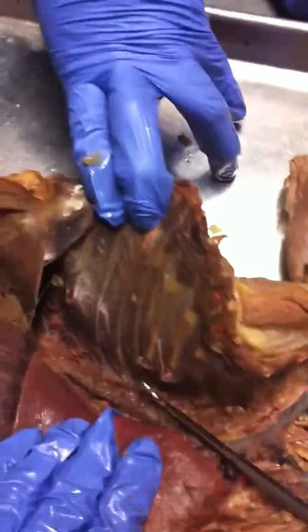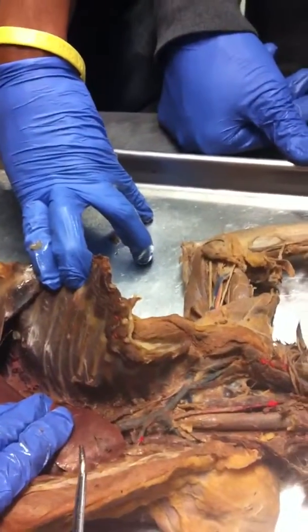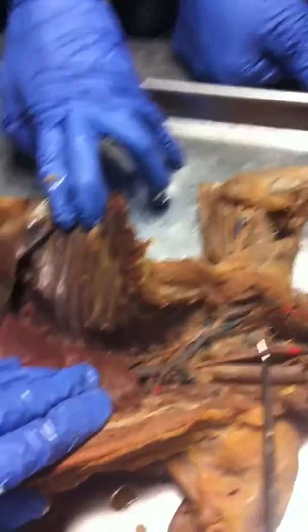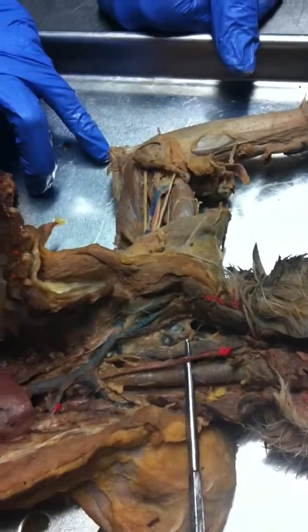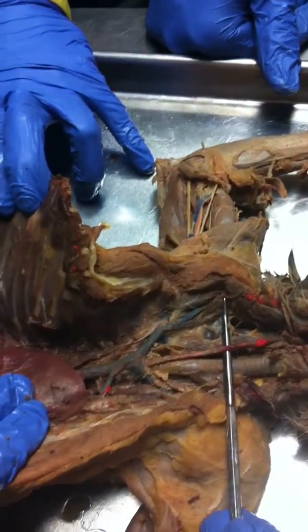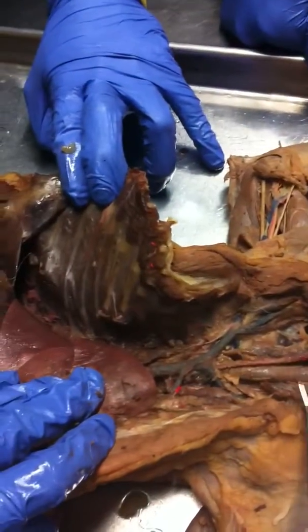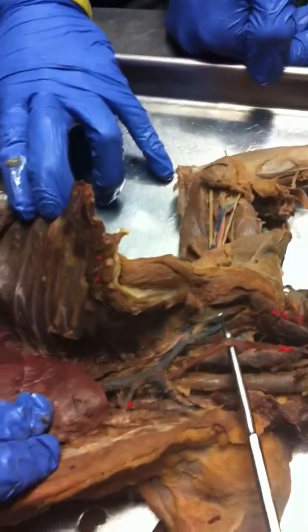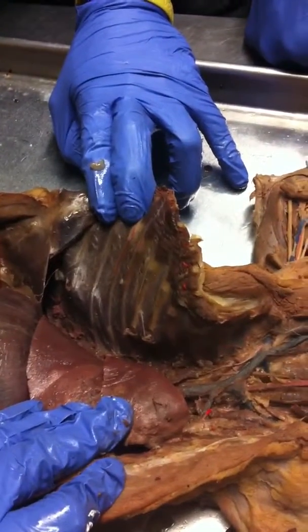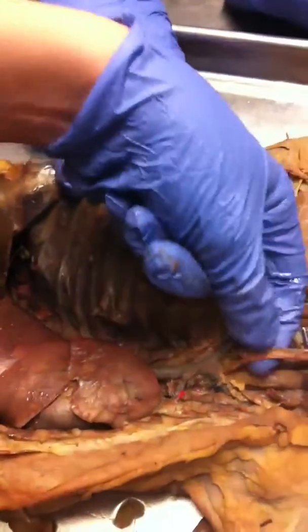Right underneath there, there's a thing right here. Common carotid artery. We forgot common carotid artery. Right, this would be the common carotid. And the common carotid, the internal jugular vein, and the vagus nerve all run together. So it's probably all sheathed together. The other ones were probably separated out. And it's all under sheath. So which one is the vagus, what's right next to it? That one. What is that?